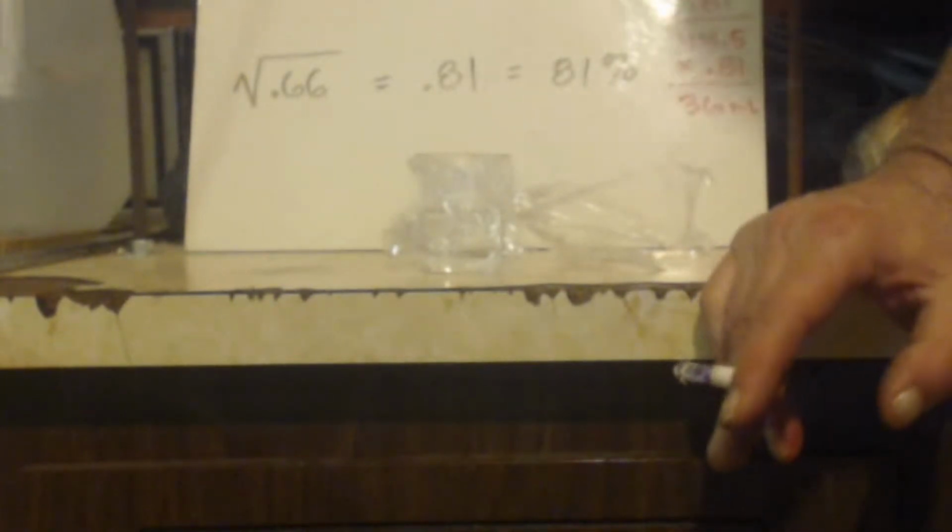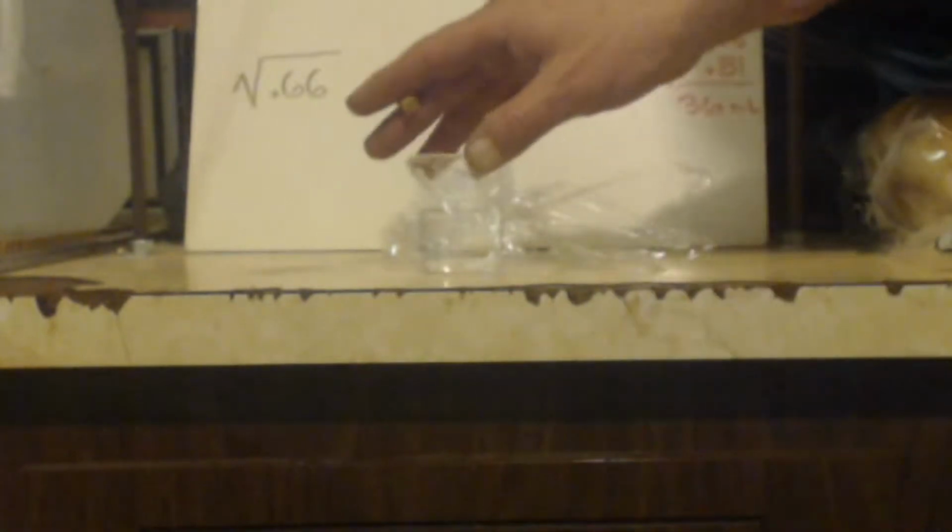And I couldn't get anything else to come over. After a couple of hours of it being already filled up and still nothing but that drop, I assume there's no water in this. So if I have time, I don't know if I will. I don't think I will, especially since I combined these together like an idiot and forgot.